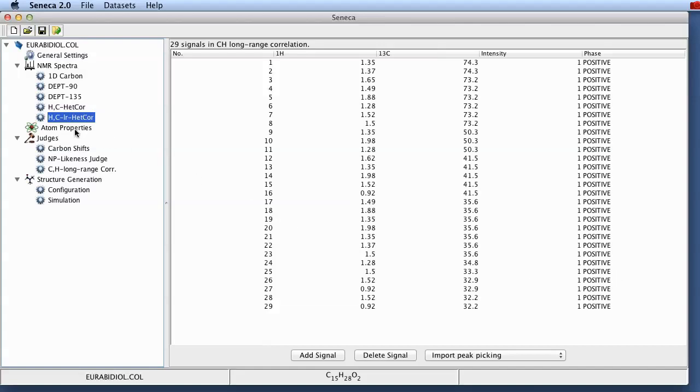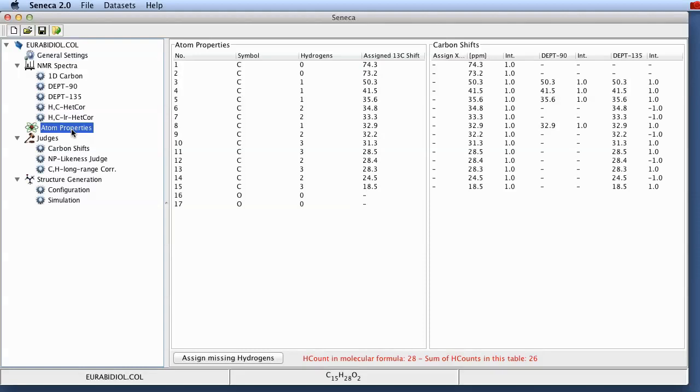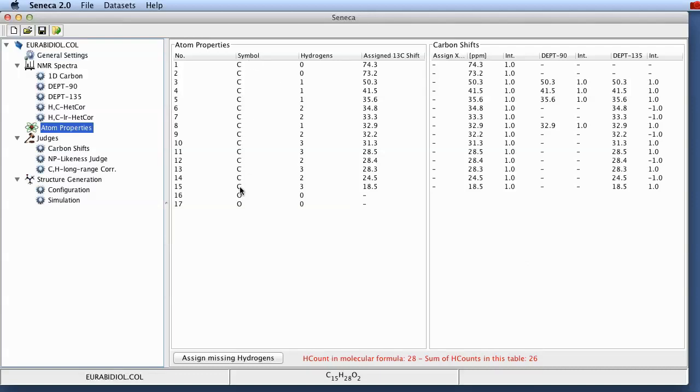The next part is something that requires your interaction. This is the central panel for the assignment of the spectral information to the atoms from the molecular formula. As you can see here Seneca has expanded those 15 carbons and the two oxygens, the heavy atoms from the molecular formula into just a column of atom symbols. And then it went through the spectral information and did an assignment of the chemical shifts from the carbon atom to all of the carbons in the molecular formula.